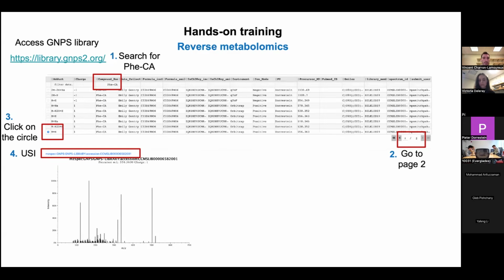You can label the peaks, then create a snapshot of it and put it in papers and such. Oh, I see. It's the same spectrum, but with labels, right? Yes, you can choose your labels and how you want to view it. Okay, thanks.